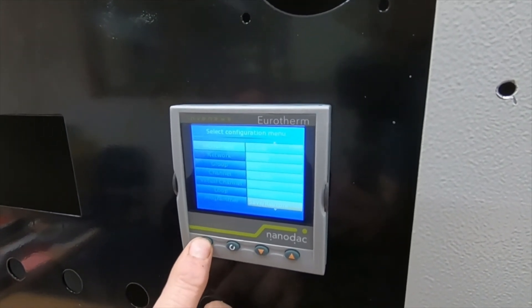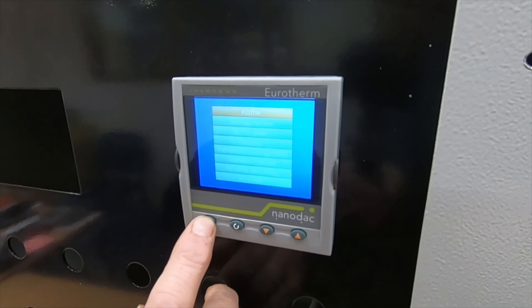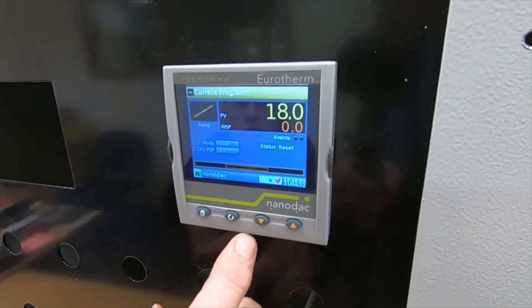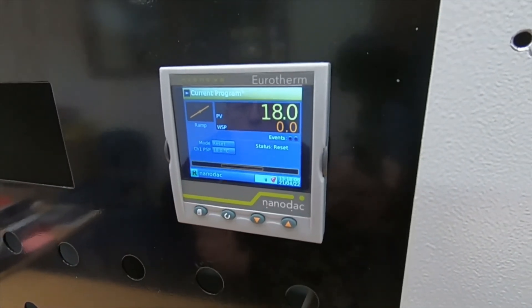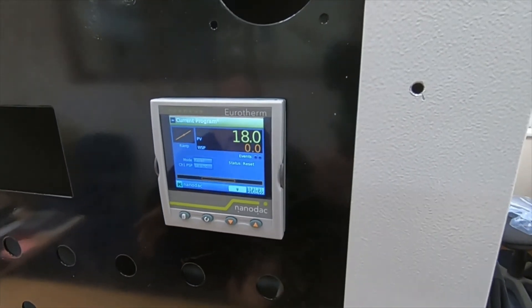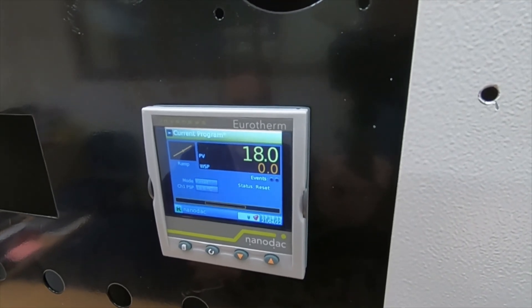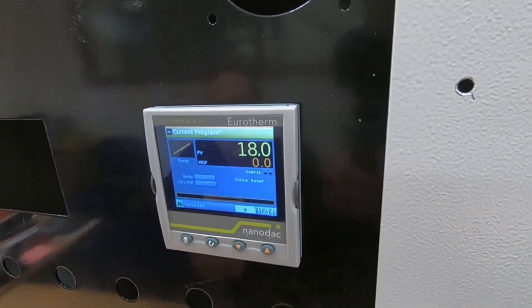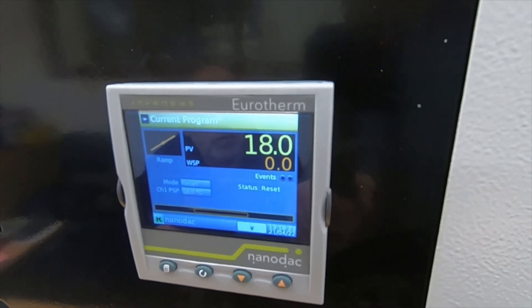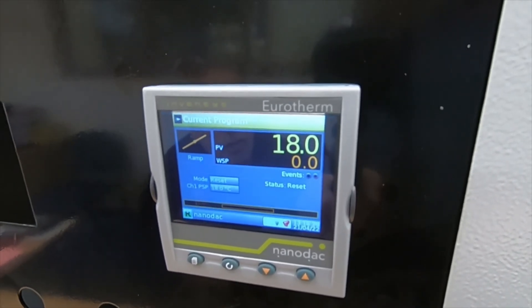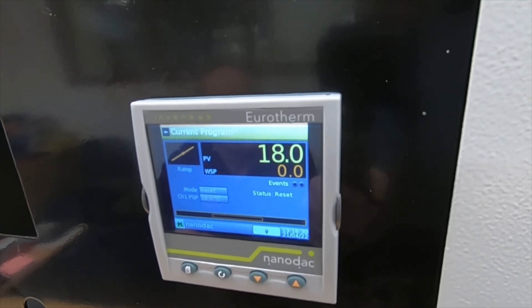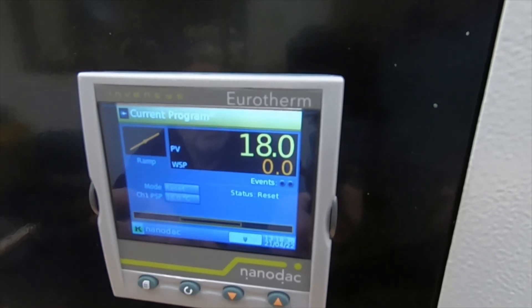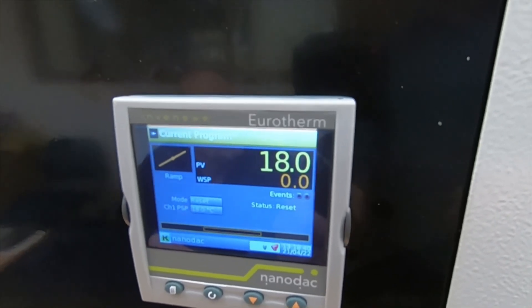Once it's restored it comes up as status complete. Scroll out, keep scrolling out — we want to log out because we're in engineer mode and we can't operate it from there. Press your down cursor once to get back to your normal screen. The program will only run in supervisor mode — that's to stop anybody randomly coming along and starting it by mistake. When it's demanded, either via selection of mode or a remote signal, it will start up automatically.